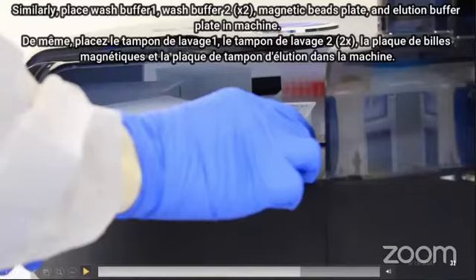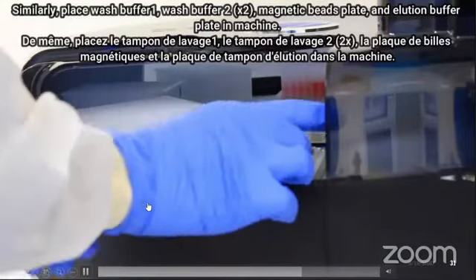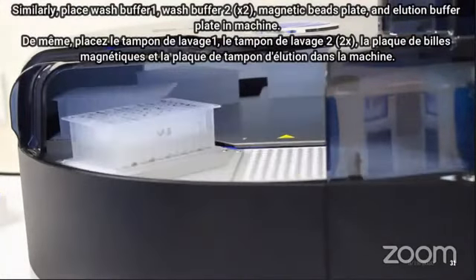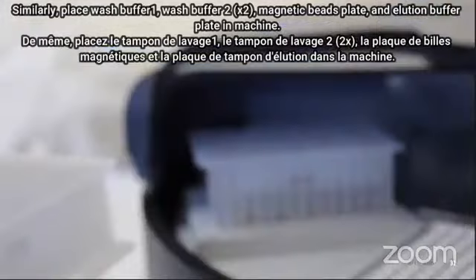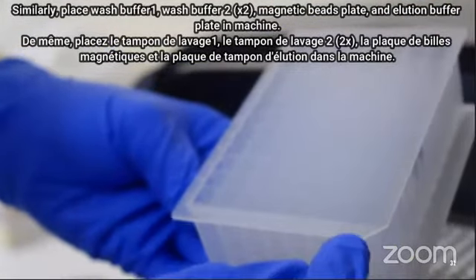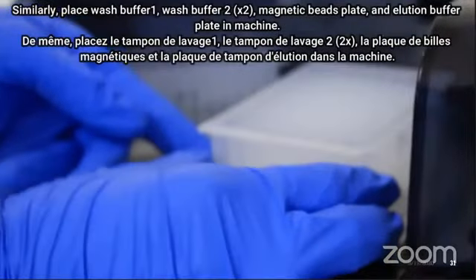So after adding all the plates of lysis buffer, spin tips, wash buffers 1, 2, magnetic bead plates, this is the missing corner of the plate.